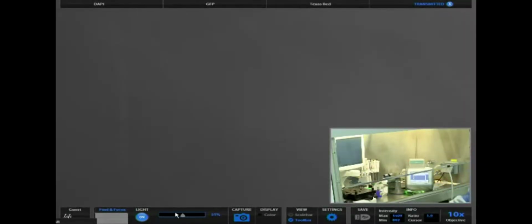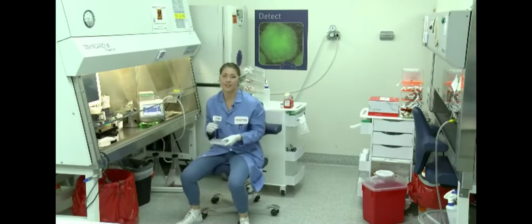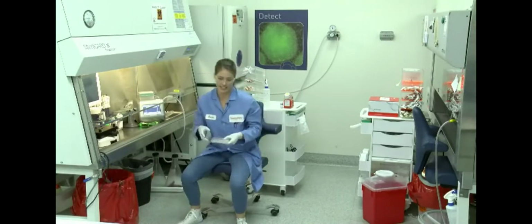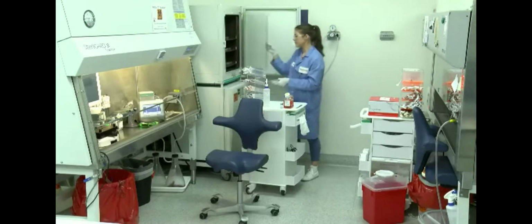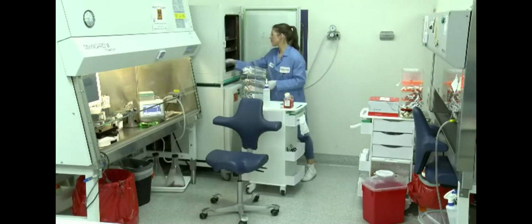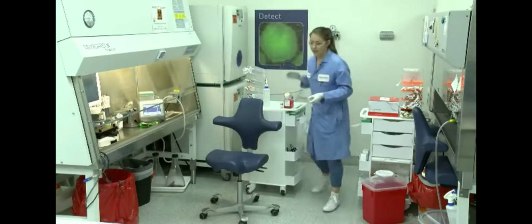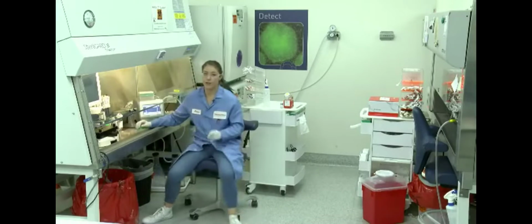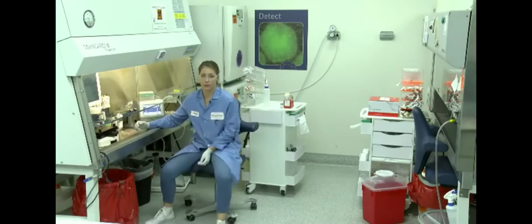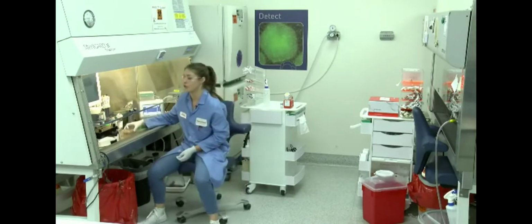You want to put your plate directly into an incubator at 37 degrees, just to make sure that the cells adhere to the plate and recover nicely. It's recommended that you leave your cells untouched in the incubator for overnight or 24 hours to make sure that they attach appropriately and recover nicely. I prepared an electroporation yesterday so that you can see what the cells will look like about 24 hours after electroporation, so I'll show you on the microscope.